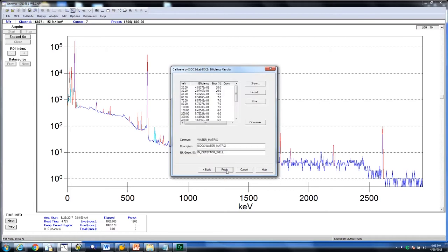You will be presented with the input values that were just created in Geometry Composer. The values show the energy followed by the efficiency for each energy and the uncertainty or error in percent for each particular point.